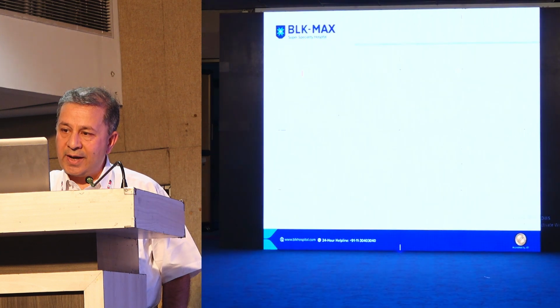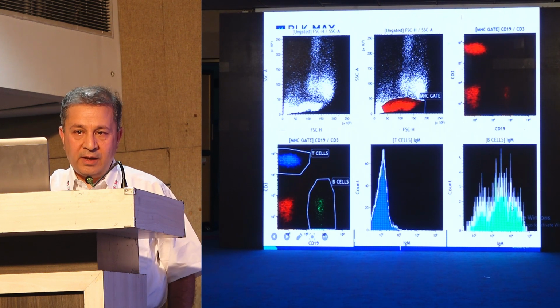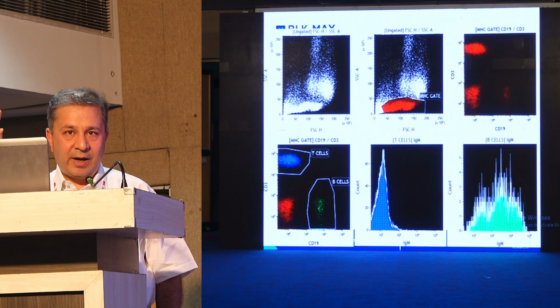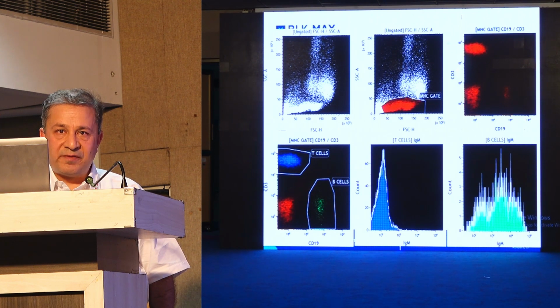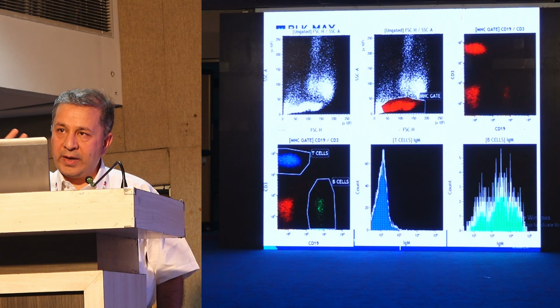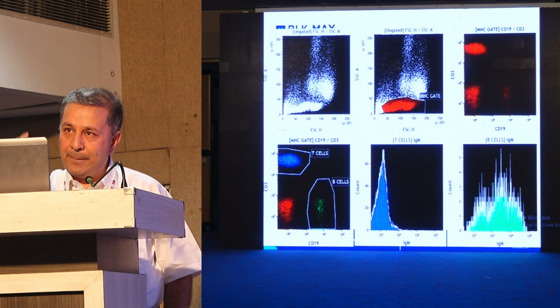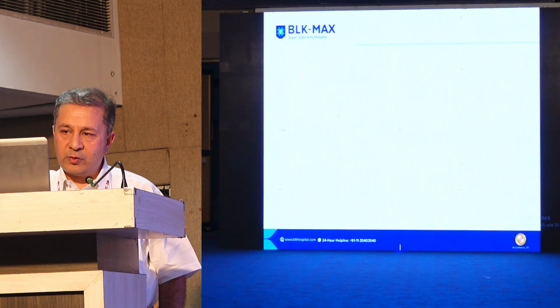And then when we look at IgM, this is how IgM looks. Just look at the B cell IgM, it spreads out. The reason is because B cell has got a higher number of Fc receptors, and IgM is a very sticky antibody. It goes and binds to that a little more, and therefore you're able to get that kind of a shift in your graphs. So therefore, it is numbers which become very important when you look at flow cytometry.